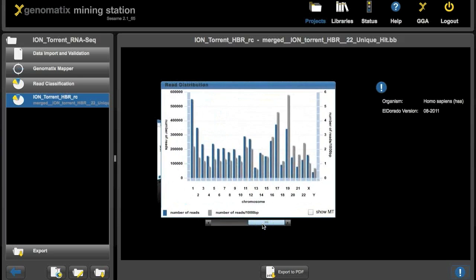And here is the statistic distribution over the chromosomes, in absolute numbers and reads per thousand base pairs. So that is all I wanted to show you about the first level analysis.